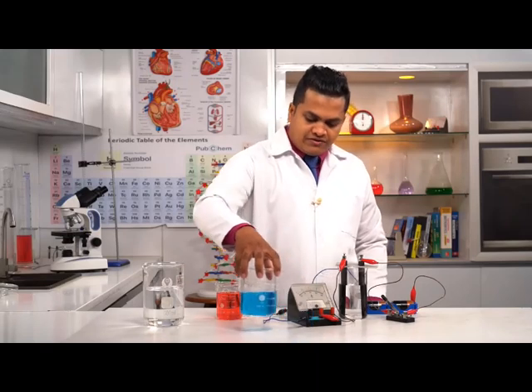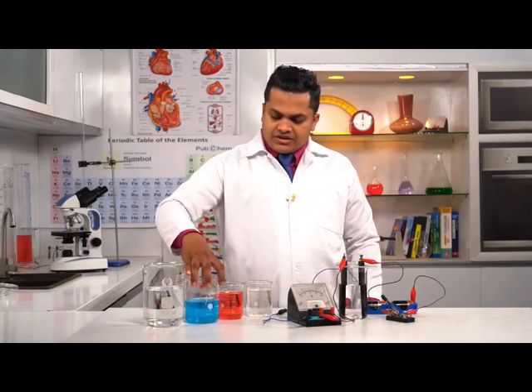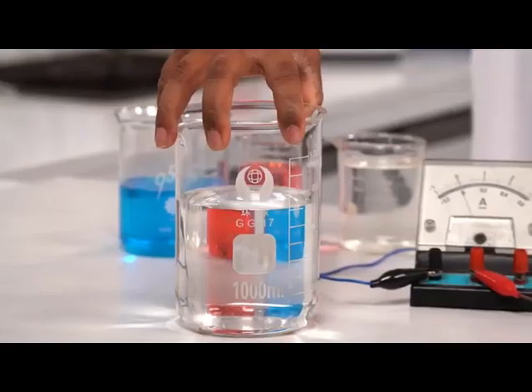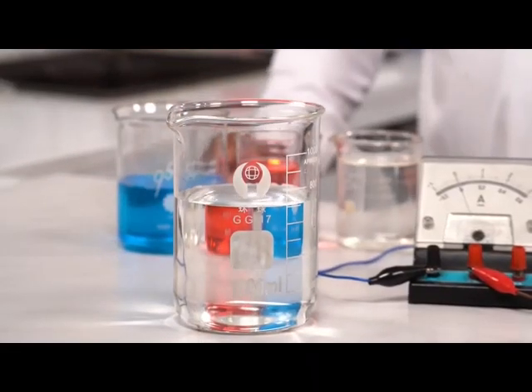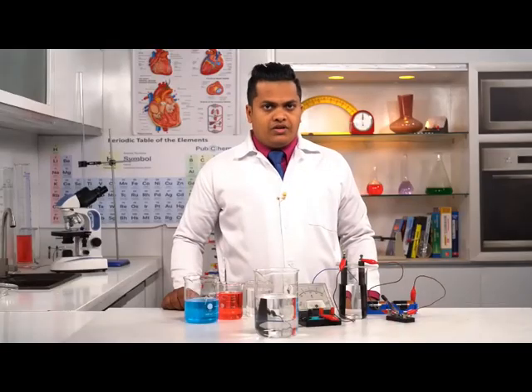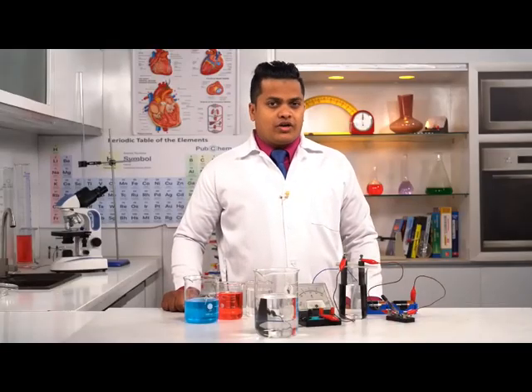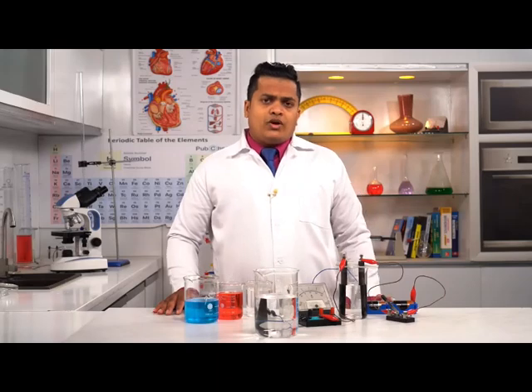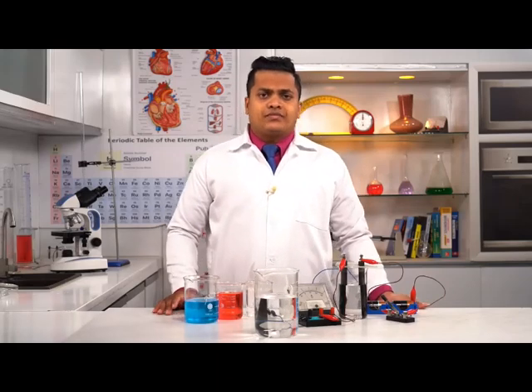Then my dear children, finally, within the larger beaker over here, this is water. But however, this is distilled water, not straightforward drinking water. So what do you mean by distilled water?